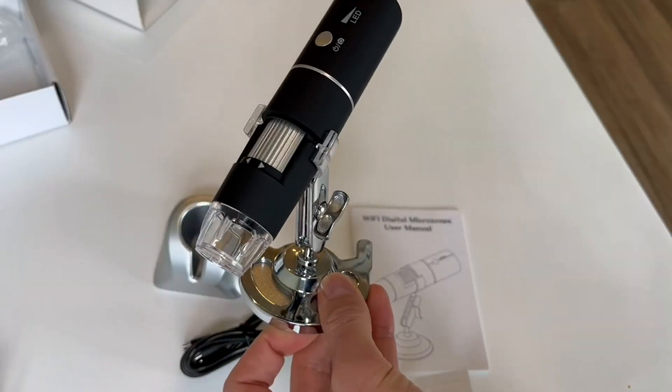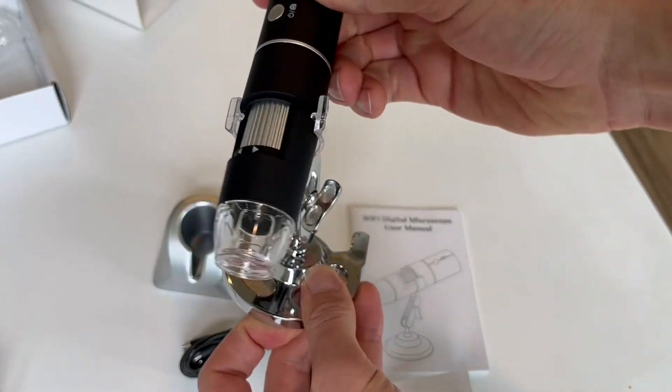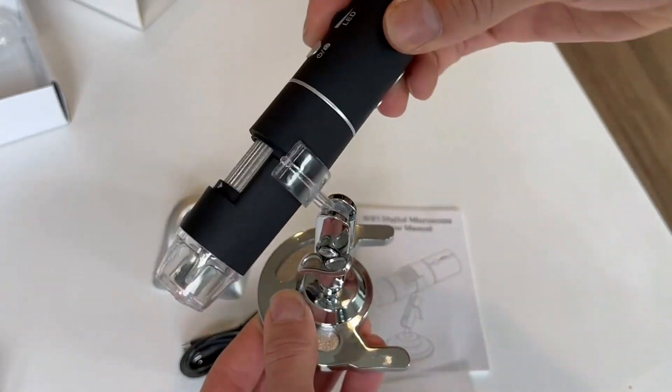There's a bunch of different things that you can look at and experiment with. Overall, this thing is super cool. The app is very easy to use and download, and it hooks up through Wi-Fi. Definitely recommend it.